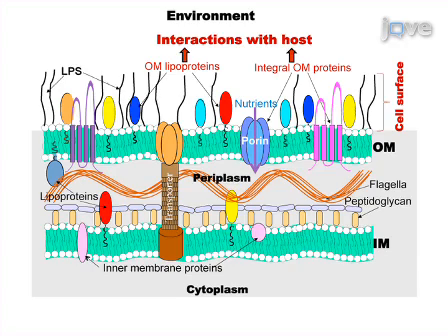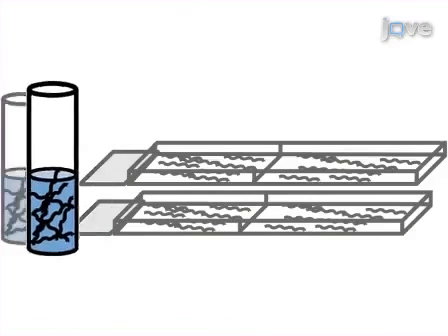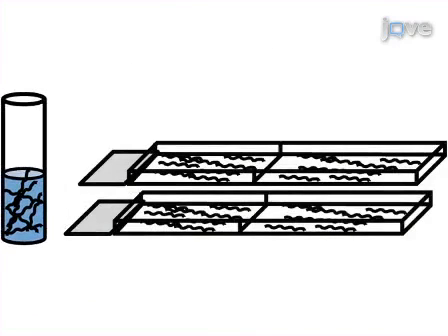In comparison to previously described immunofluorescence assays, the details of the method described here are designed to minimize the manipulation of cells in an effort to maintain outer membrane integrity. First, leptospiral suspension is added to glass chamber slides. The slides are incubated to allow the cells to adhere.